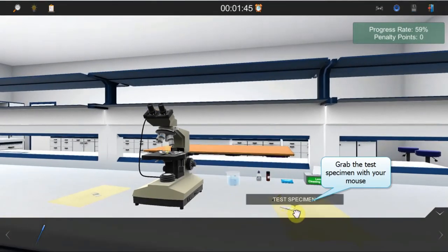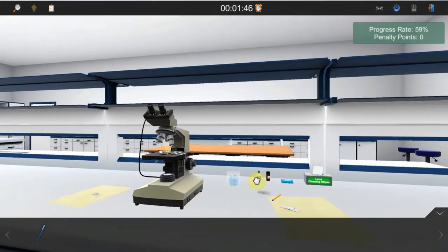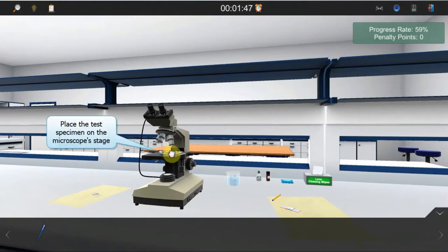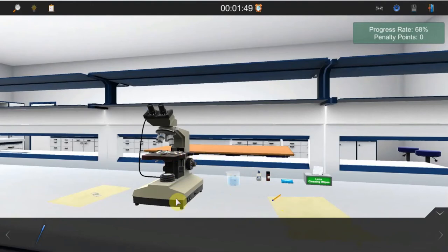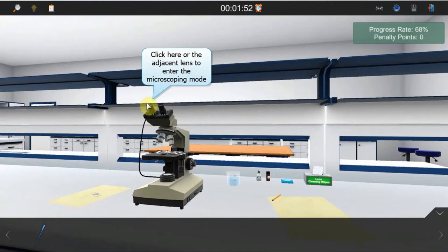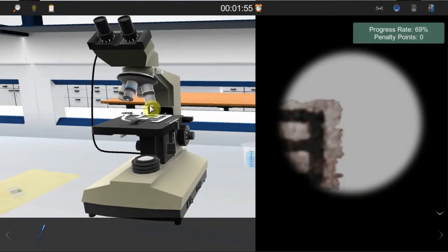Place the test specimen on the stage of the microscope. Enter the microscoping mode by looking through the eyepieces and clicking the glass of an ocular.